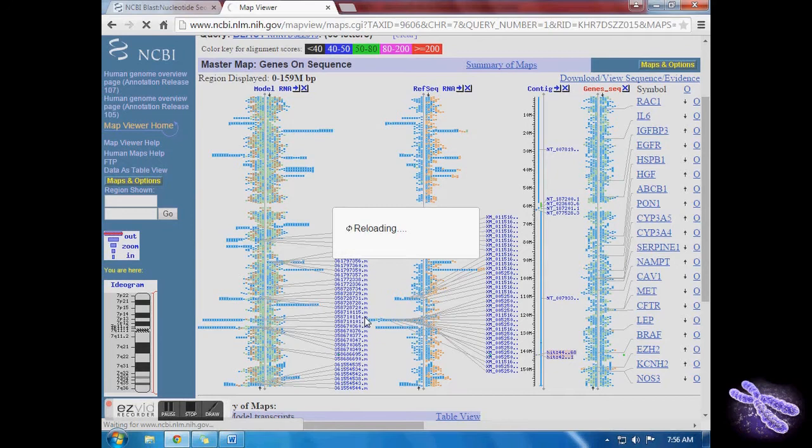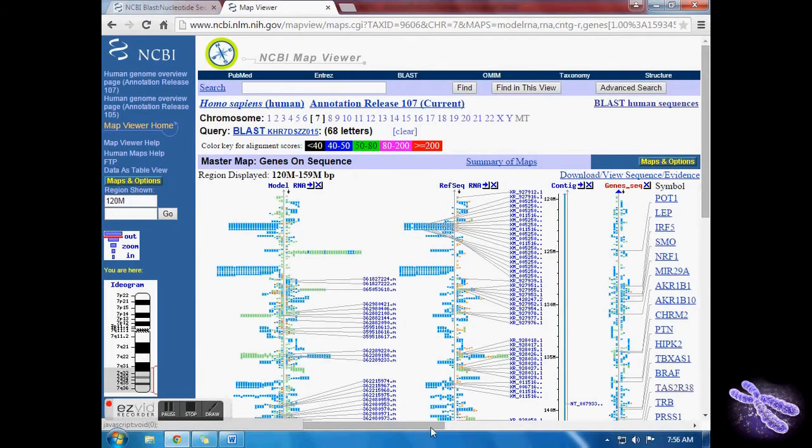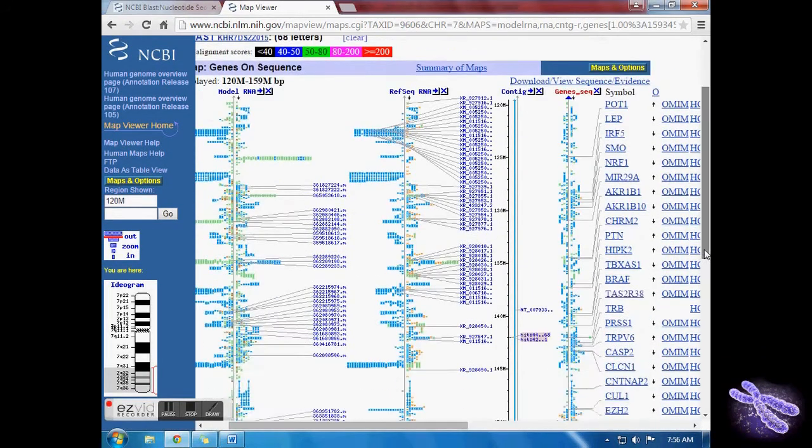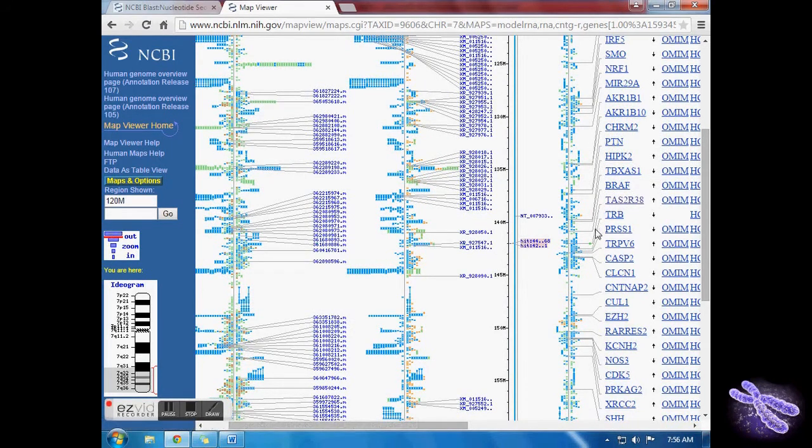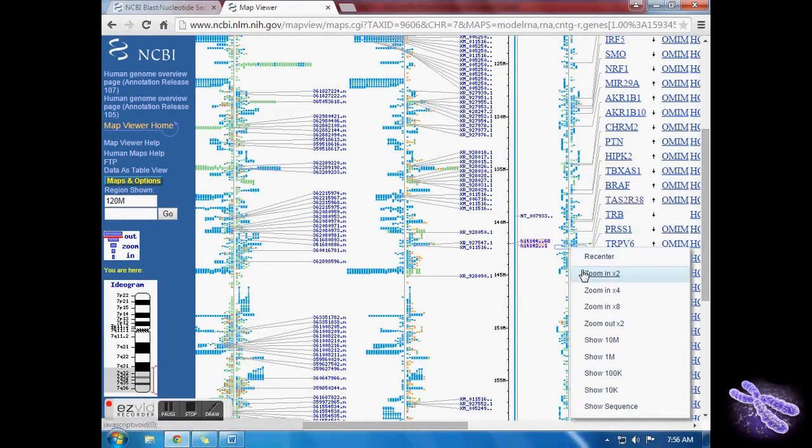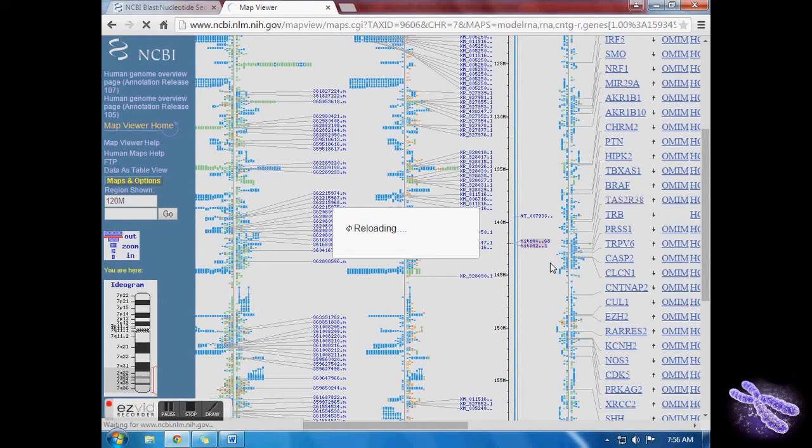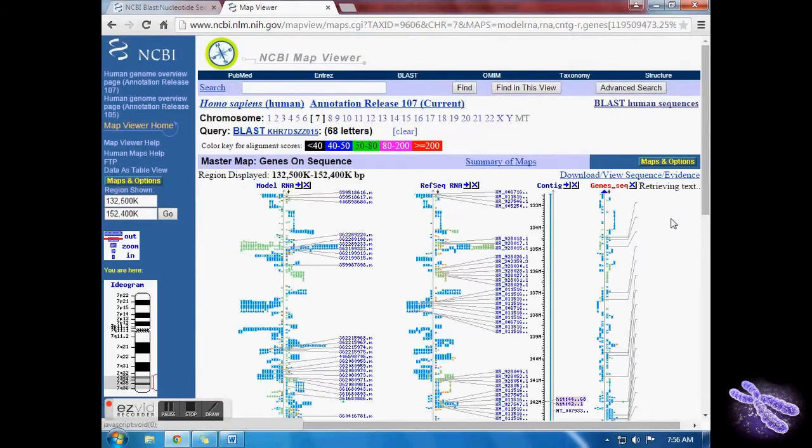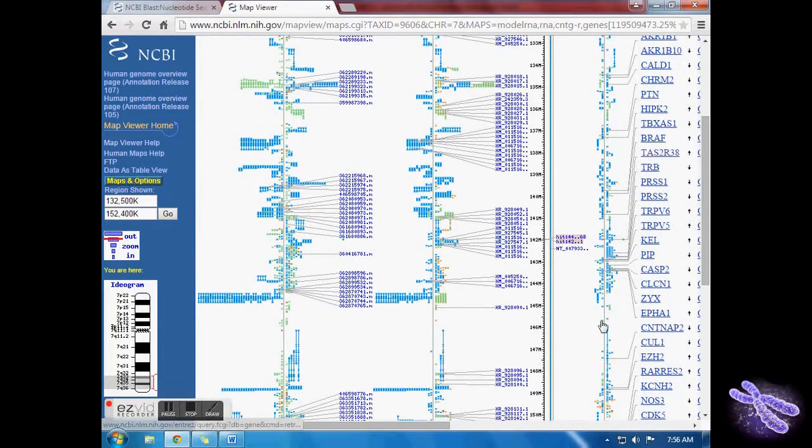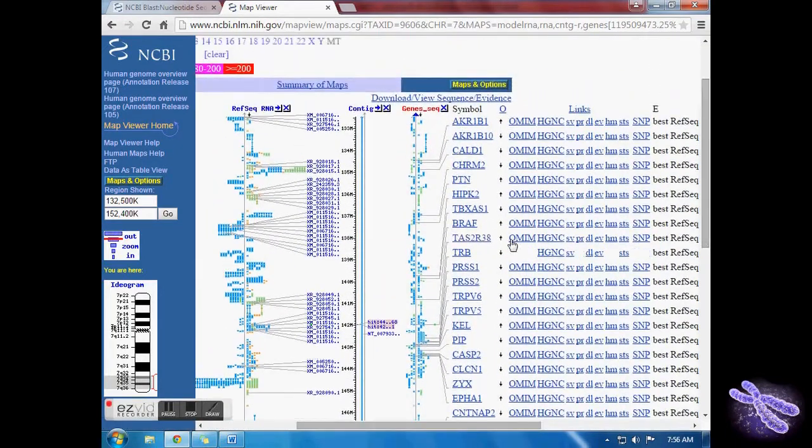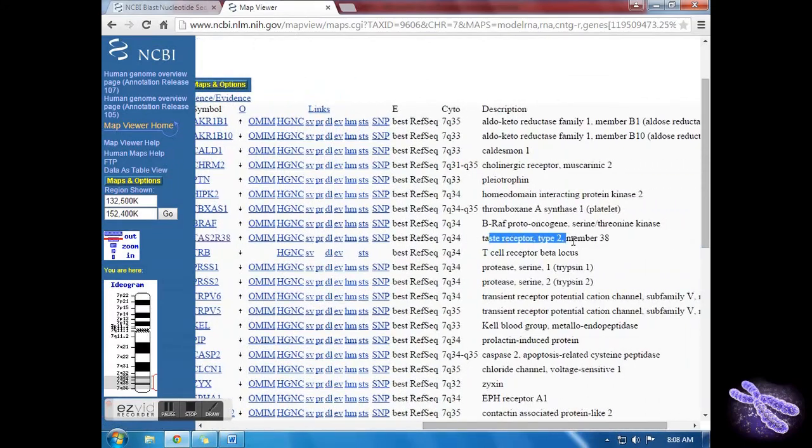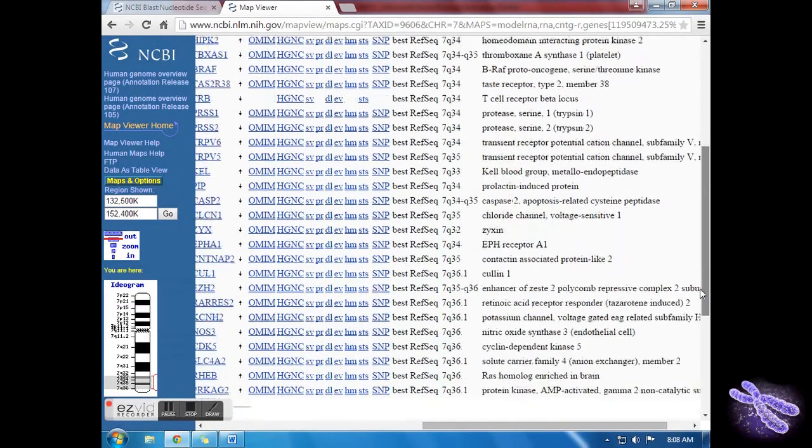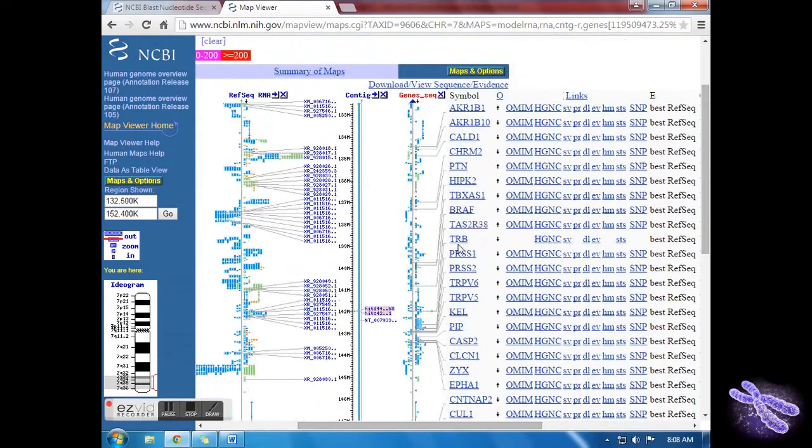The magnified portion is the part of the chromosome where the gene is located. To zoom in further, follow the line from the gene and click. Scroll up and down to locate any neighboring genes that are next to the TAS2R38 gene. And you may zoom in as many times as needed to get a closer view.